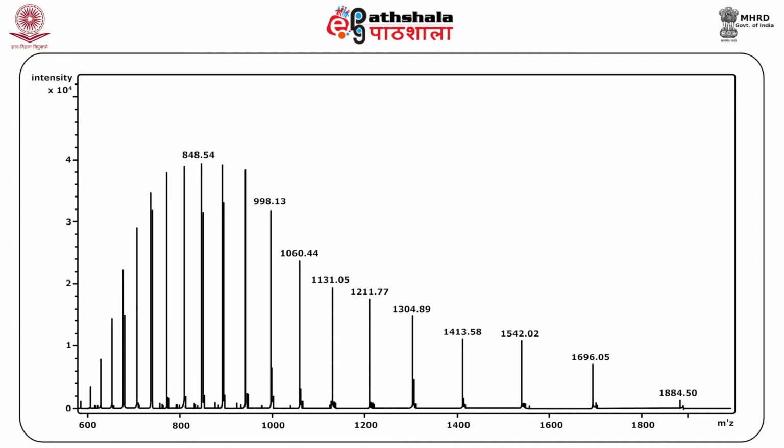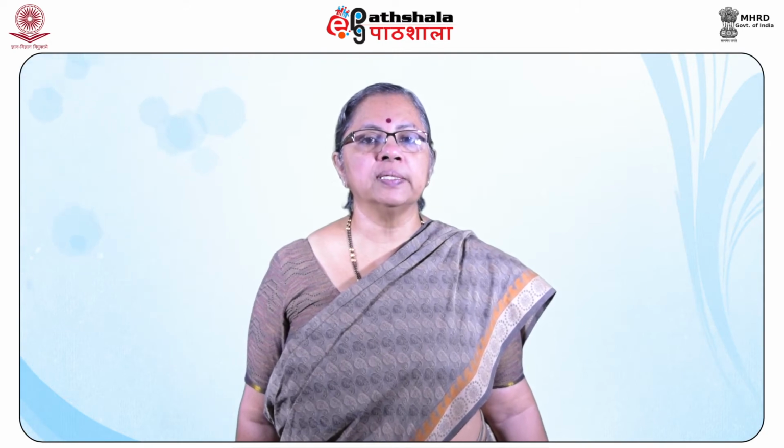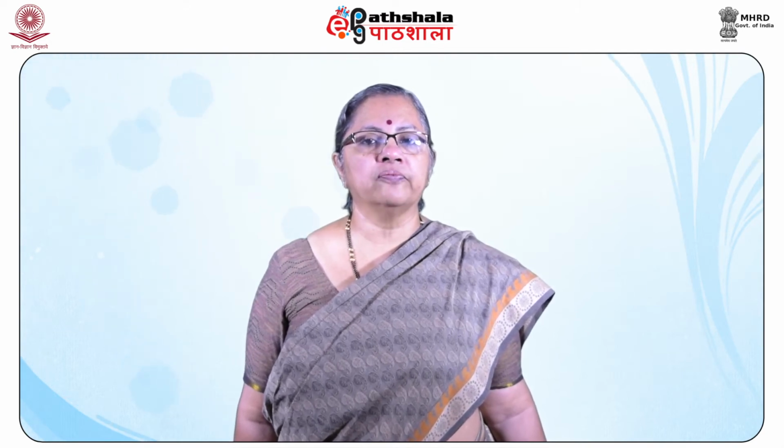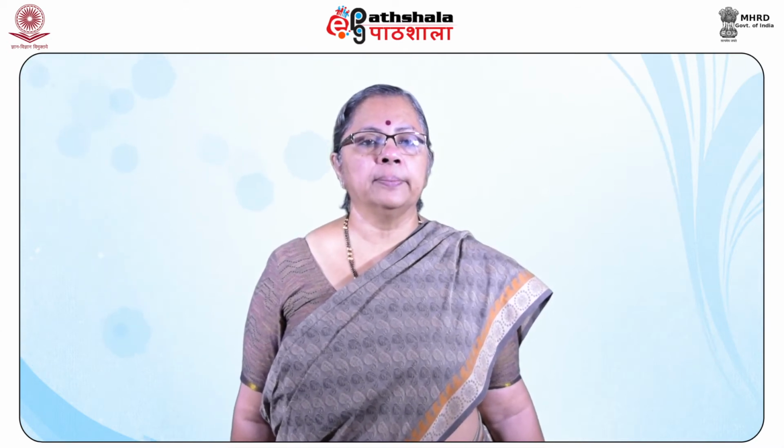If the charge or Z value of the ion is known, its mass can be more accurately determined. Alternatively, if the m/z values of two adjacent peaks of a peptide of mass M are alpha 1 and alpha 2, arising from ions of Z1 and Z1 minus 1, then two linear equations can be derived from which the values of M and Z1 can be derived.